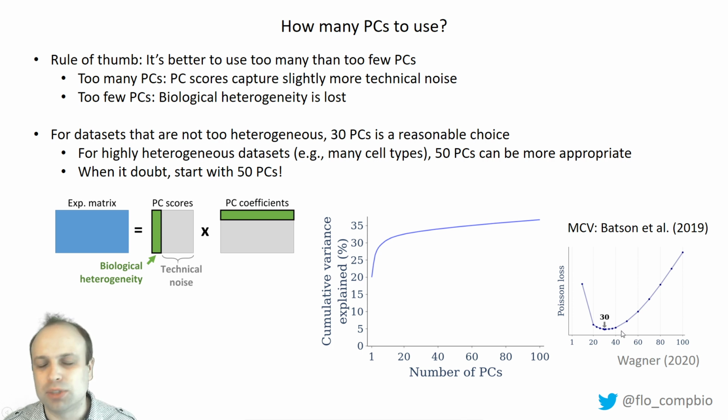It takes much longer. So if you're interested in it, take a look. I included it in the software that I published recently, Monet, the Python package for analyzing single-cell RNA-Seq data. And you can also look at this paper. But like I said, you can approximate the number of principal components, and that usually works fine.